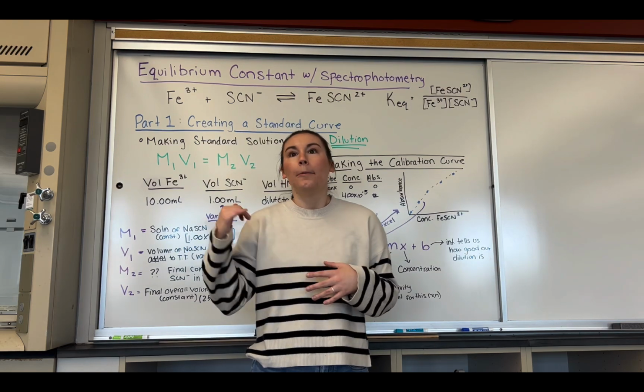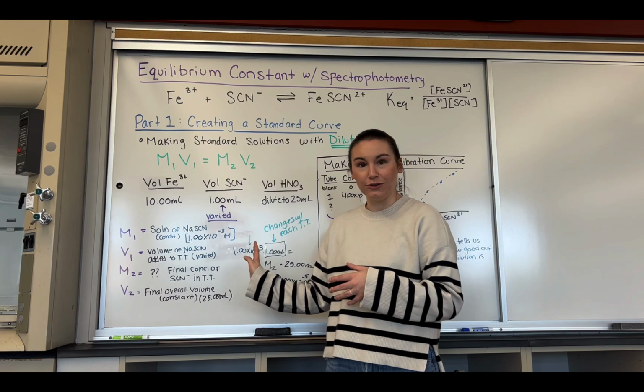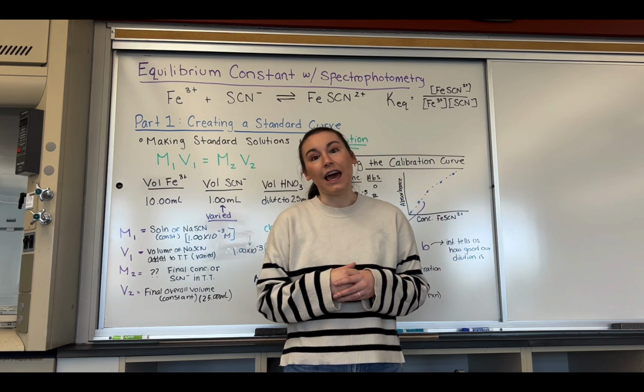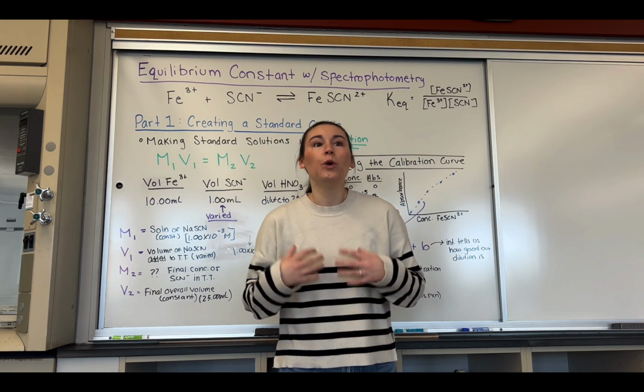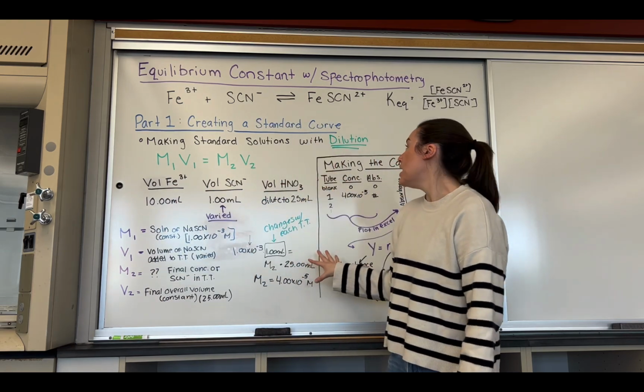The dilution math-wise is the same in our second part, but we do have some slightly different values to use. Okay, so we'll take a look at that when we get to part 2. What I want to jump into now is the experimental portion that relates to part 1.